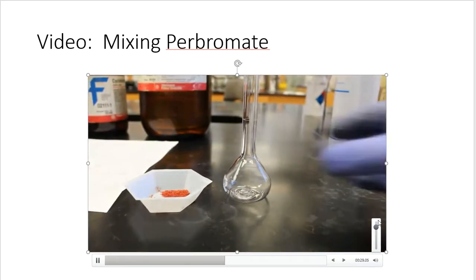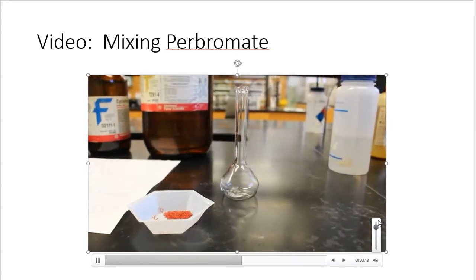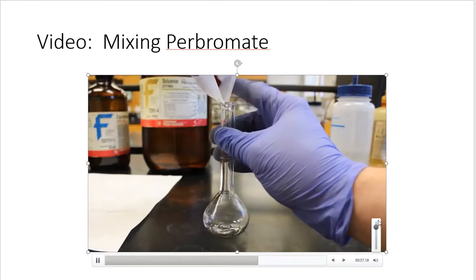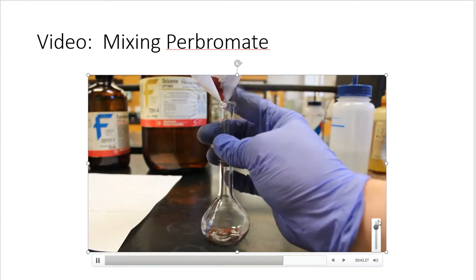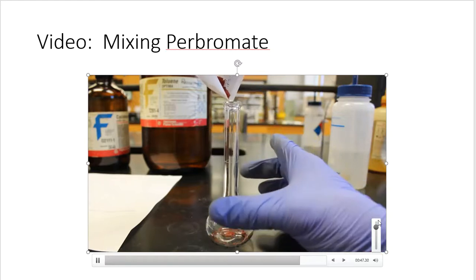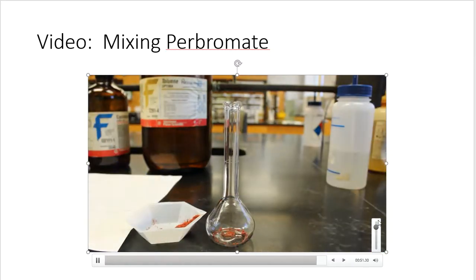All right, so I'm going to zoom out so that way you can see that process a little bit better. And there we go. Creates a nice angle. I'll just tap until I can get all of those crystals down into this volumetric flask. So I'll keep doing this. I won't waste any more of your time, and we'll pick up after I transfer it over.